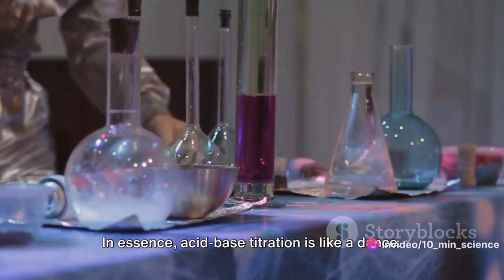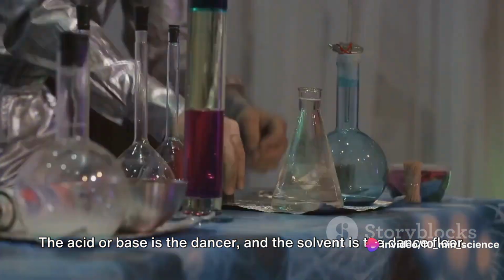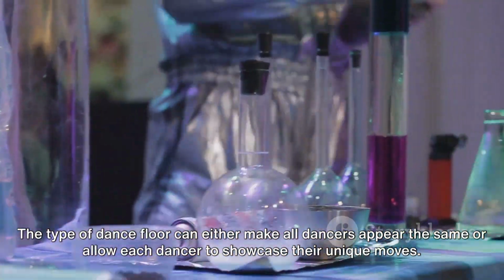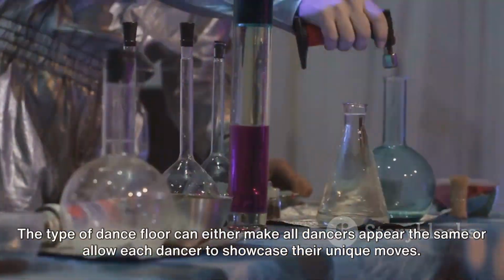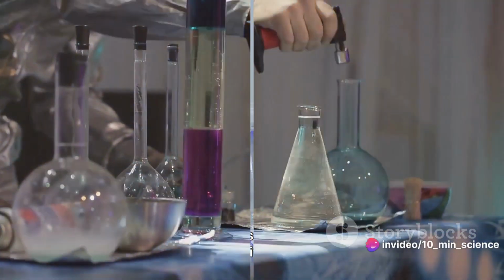In essence, acid-base titration is like a dance. The acid or base is the dancer, and the solvent is the dance floor. The type of dance floor can either make all dancers appear the same, or allow each dancer to showcase their unique moves. In the world of titration, it's all about finding the right balance.